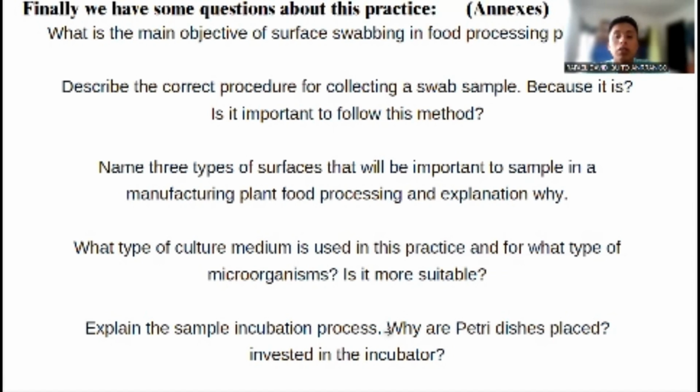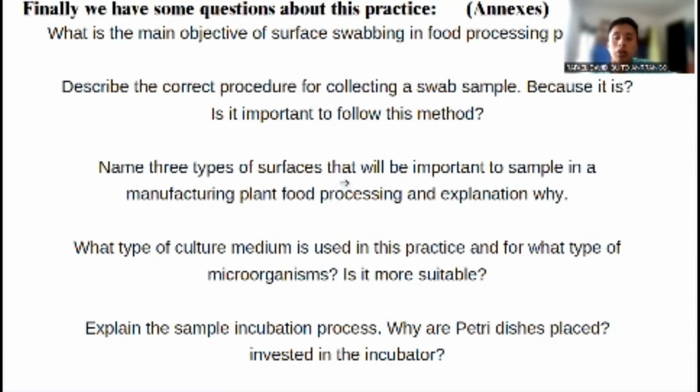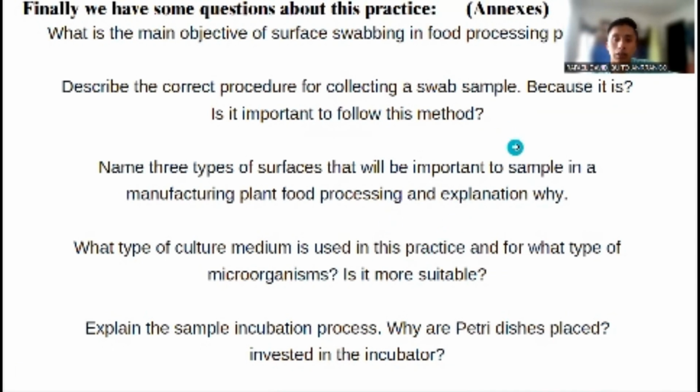This is so important because we can detect if microorganisms are growing in products and avoid these microorganisms growing and damaging people, because it's so complicated to contain. And this method is very effective, and especially in processing food.